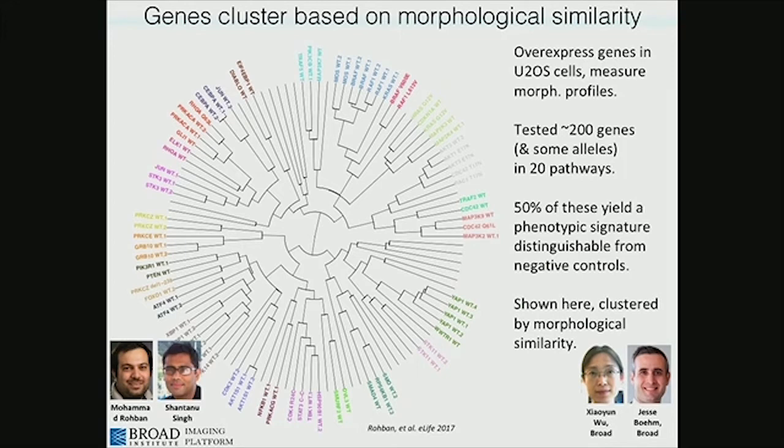And even though we intended this experiment to be a pilot, and we didn't expect to discover anything new, we noticed that the hippo pathway was one of the nicest clusters formed here, and we saw that a gene on the opposite side had an opposite profile to the hippo pathway, and that was in the NF-kappa B pathway. We had some collaborators who were interested in this pathway and agreed to follow up and verify that there really is a negative transcriptional crosstalk between these 2 pathways that was undiscovered, even among these relatively well-known genes that we had tested.